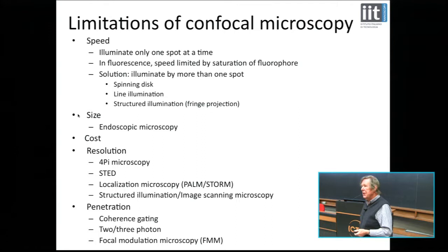I'm not going to go all through this. But you see, it's not fast enough. It's too big. It costs too much. And so on and so on. The other problem is resolution, and how to improve the penetration. I've said a bit about the speed already. The fact that it's slow is because we're illuminating one spot at a time.